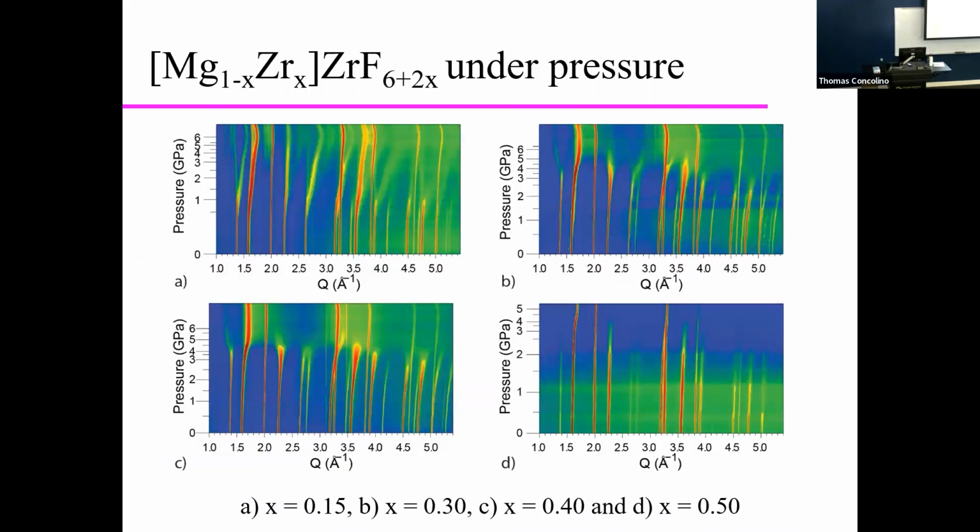What about high pressure transitions in this material? Well, actually, our trick solves those problems as well. So these weird looking panels, again, are powder diffraction patterns. Each one of these lines is a bright peak. There are hundreds of diffraction patterns put together so that you can see how these peaks evolve as you increase pressure. So this is my pressure axis.